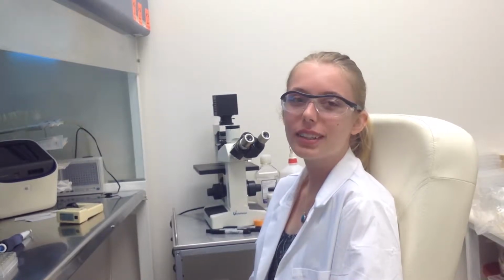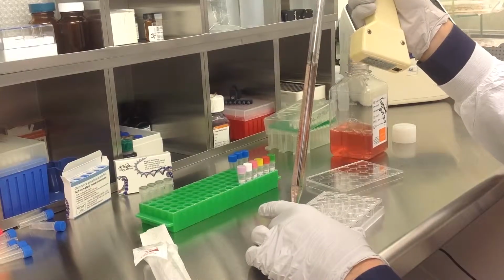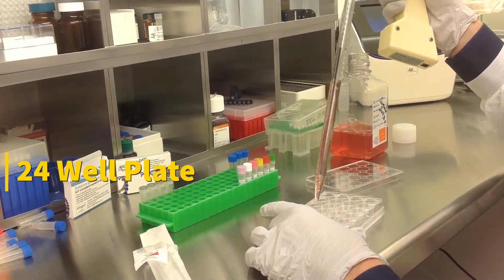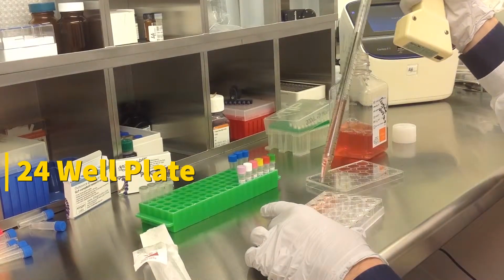Today we will be transfecting CHO K1 cells obtained from ATCC. We will be using a transfection kit manufactured by Altogen Biosystems. In this tutorial, we use a 24-well plate. Transfections can be scaled up or down based on plate surface area as described in the corresponding transfection protocol, which can be found at altogen.com.